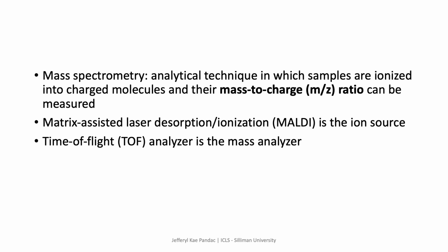Mass spectrometry is an analytical technique in which samples are ionized into charged molecules, and the ratio of their mass and charge can be measured. In MALDI-TOF, the ion source is matrix-assisted laser desorption or ionization, or MALDI, and the mass analyzer that is used is the time of flight, or the TOF analyzer.